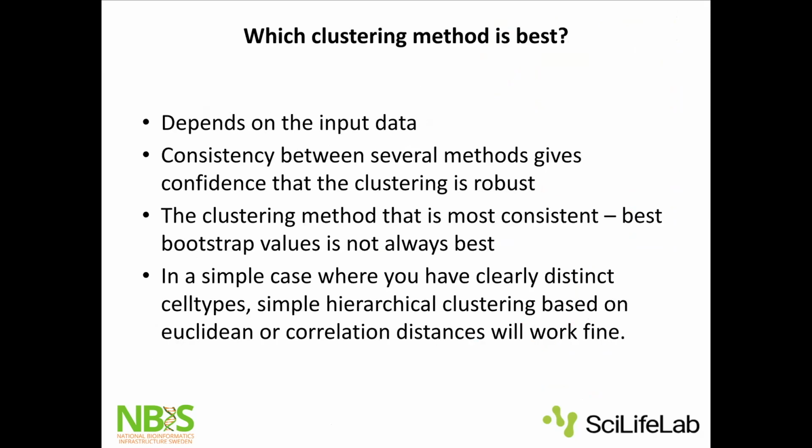So then the question that everyone asks is, which clustering method is best? And as always, like Jennifer said before, you have to explore and try. It always depends on the data. There's not one single answer. Consistency between several methods is a good idea. So if you try very distinct methods and they give the same results, that would give me a lot of confidence.